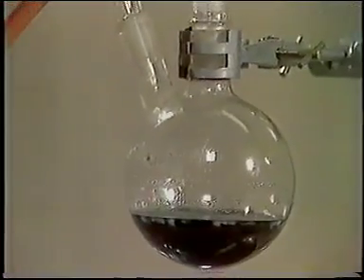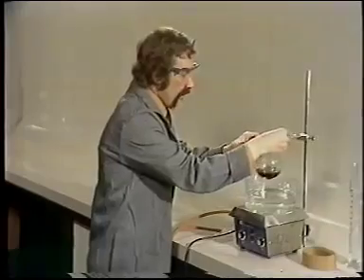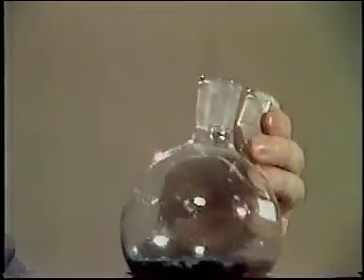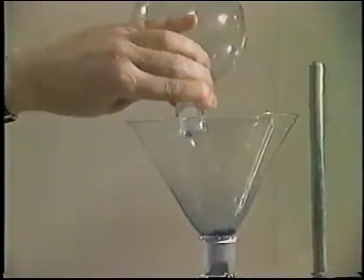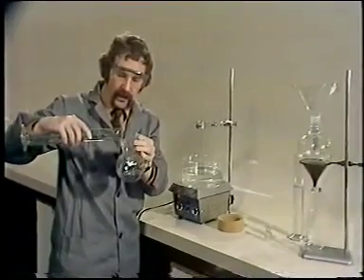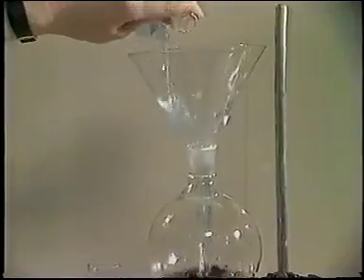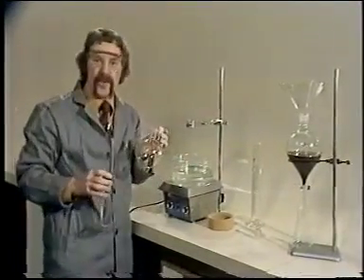Here we have an identical reaction mixture, only this one has been allowed to go cold. The mixture contains both organics and inorganics, and the first thing we do is to pour it into a separating funnel. We work on the principle that like dissolves like, and so we begin by diluting the mixture with water. That takes care of the inorganics.